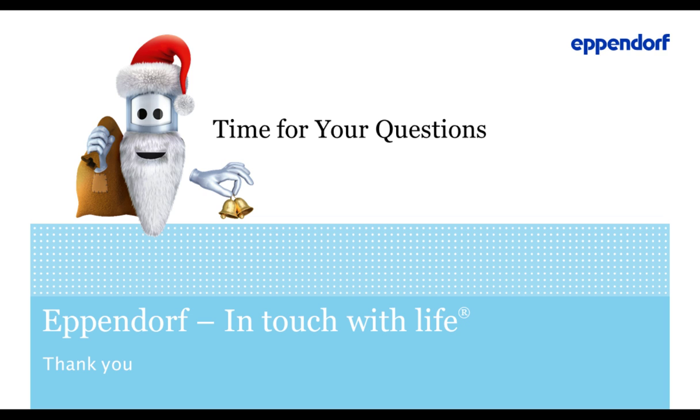And the bioreactors? The short answer would be it doesn't really matter. Read the manual. But we have recommended minimum working volumes and, of course, a maximum working volume. Taking our 3-liter BioBlue as an example, in theory, I think around 3.7 liters of medium fit into the bioreactor, but the maximum working volume in this case would be 3 liters. And vice versa, I always recommend to work with at least the minimum recommended working volume, which we also tell you for each bioreactor. This ensures that when you start stirring, the sensor tips are always in contact with the medium, for example, and that the impeller is also covered by the medium.